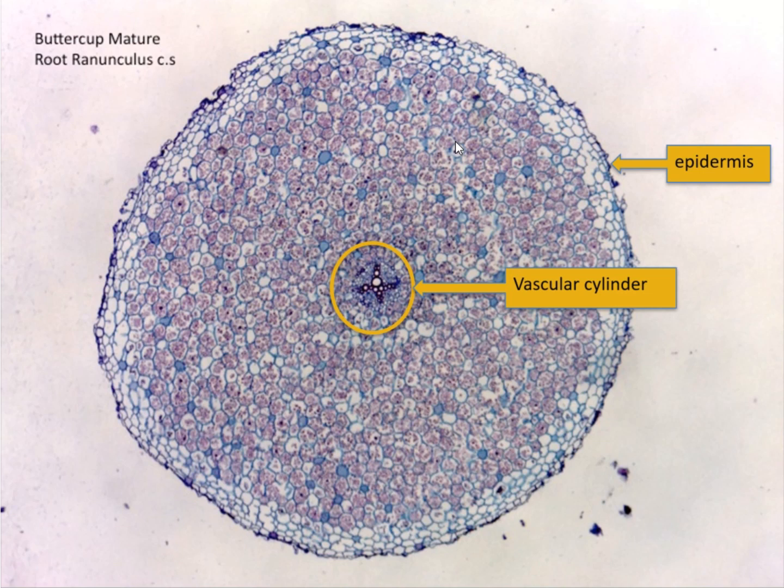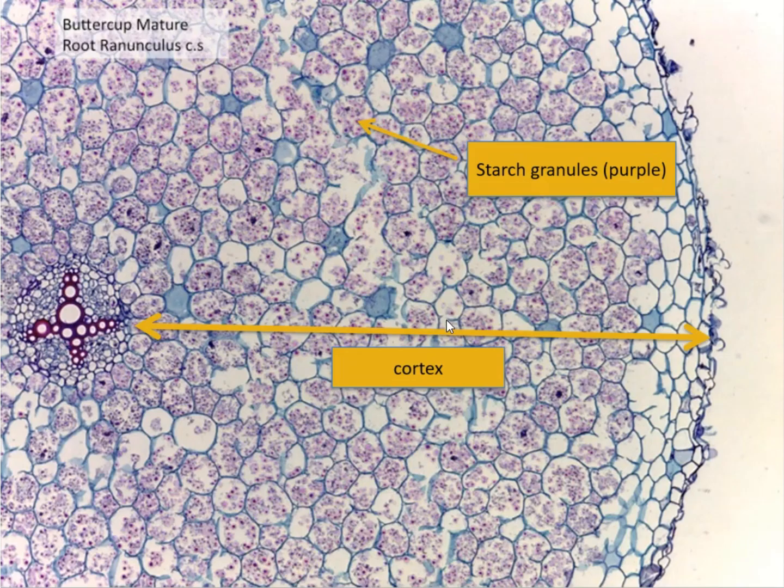It's the ability for plants and animals to respond to their environment and change their morphology. And one of the other videos we're going to post on Canvas will go over that in further detail. So let's go ahead and actually zoom in on this cross-sectional in a little bit more detail.